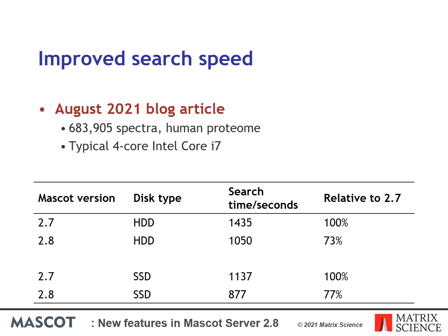As you can see in the table, the new version is faster by a good margin on both traditional hard disks and solid-state drives. The improvement also applies to multi-CPU licenses, cluster installations, and systems with RAID arrays.